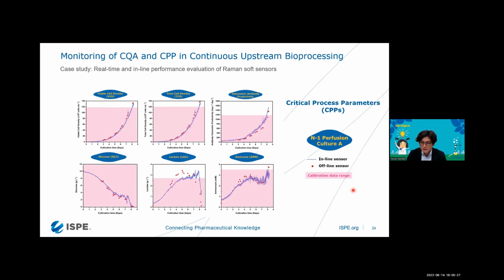After developing a model from the initial three N-1 perfusion batches, we evaluated real-time monitoring for a new perfusion batch, N-1 perfusion culture A. This slide shows the result of our study.